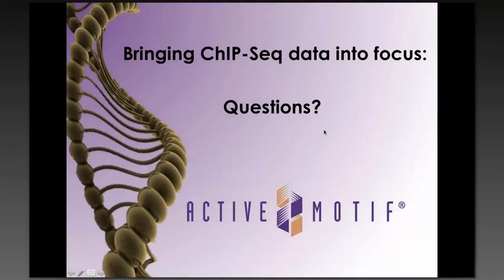So you're using an antibody that's different and trying to apply whatever happens in that reaction to your reaction of interest. In regards to sequencing input, the goal of sequencing input is, especially in cell lines, you can identify duplications in the genome. And those come across as appearing as real peaks. So it allows you to subtract out false peaks based on genomic duplications.